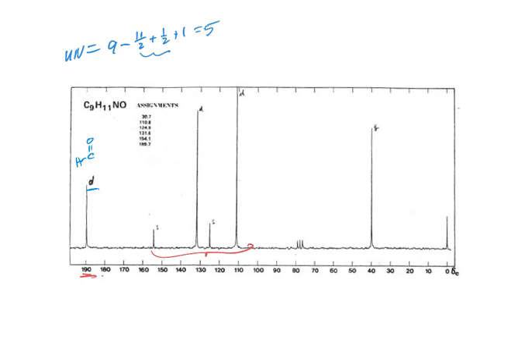Rather than, say, 200, there's something ortho or para to it, right? No, I think just this is kind of upfield for an aldehyde. So what that basically means is it has conjugation to it. So it has to be attached directly to the benzene ring. I immediately put it on the benzene. Right. Well, that's fine, but there is data to support that as well. It's just because it's not 200, it's 190. Right, because I showed those examples when we have conjugation.